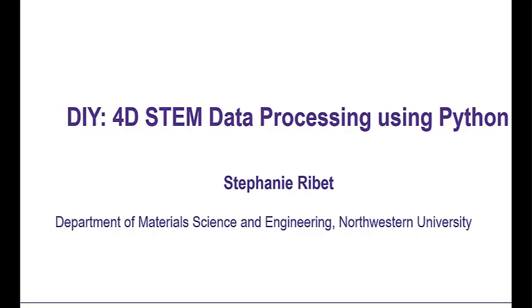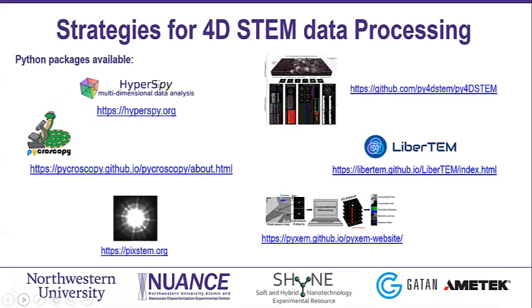I want to give a brief introduction about different strategies for 4D STEM data processing. As I mentioned in the beginning, with the usage of 4D STEM scanning diffraction by different groups around the world, there are many packages available these days. Let me move my slides. There we go. Some of them are highlighted here. I believe all of them are based on Python.